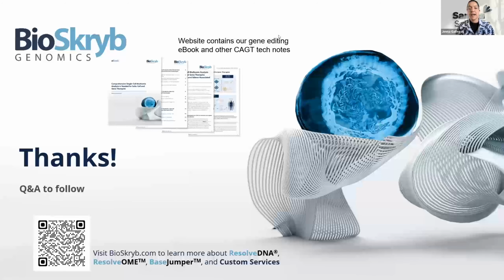Awesome. Thanks, Beck. Next question: did you use any kind of pre-selection process to choose or sort the cells that went into this analysis, maybe based on their phenotype? Totally random. Yeah, totally random cells.